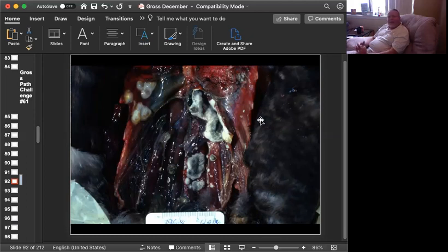And in the air sacs, there's a pretty high oxygen tension, so you do get these fluffy growths. And this is very characteristic for Aspergillus fumigatus. There can be some other ones in there, but it's almost always Aspergillus. You could see maybe a little flavus. But Aspergillus fumigatus, and a common cause. You see this a lot of times in penguins living in captivity, that just the ambient temperature and the stress of living in captivity will do it.